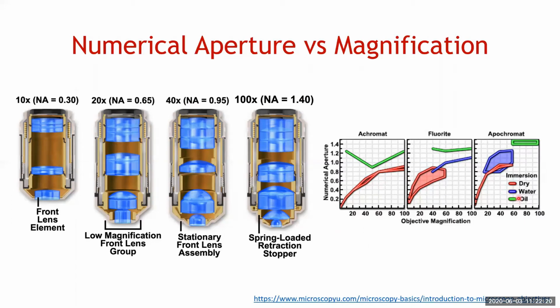When you deal with other lenses that require different immersion media, things get a little bit not so simple. And nowadays, you have lenses that have low magnification and high numerical aperture, but those are for multiphoton and tissue clearing. They have put a lot of glass in there. They're very heavy, they're very big. And you usually need a very high refractive index media to get them to work. So this is just to show you the relationship between the two.